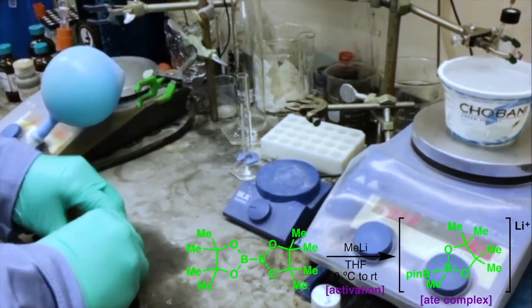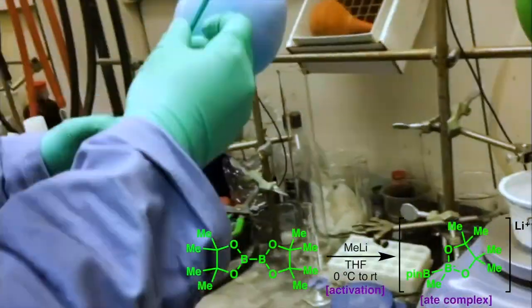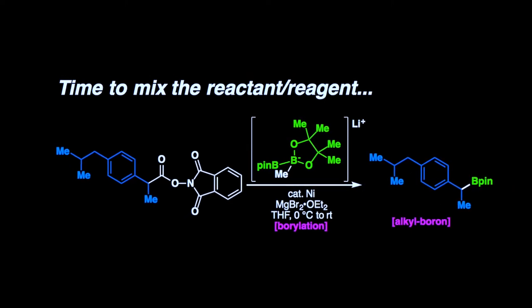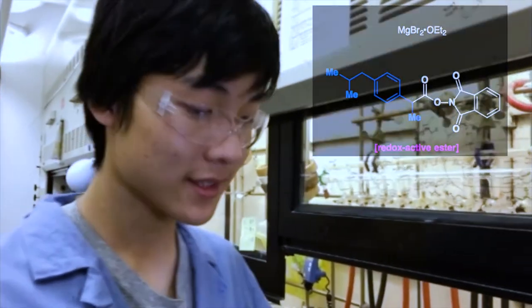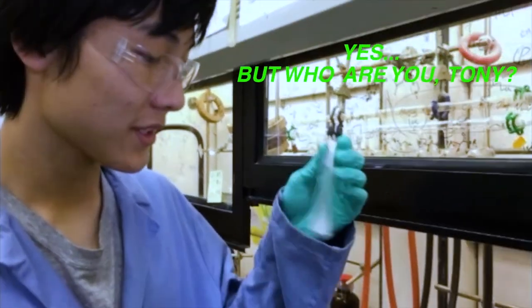Next, we're adding the methyl lithium. We have the magnesium bromide and the redox ester in the same tube, so you can see the white solid in here.